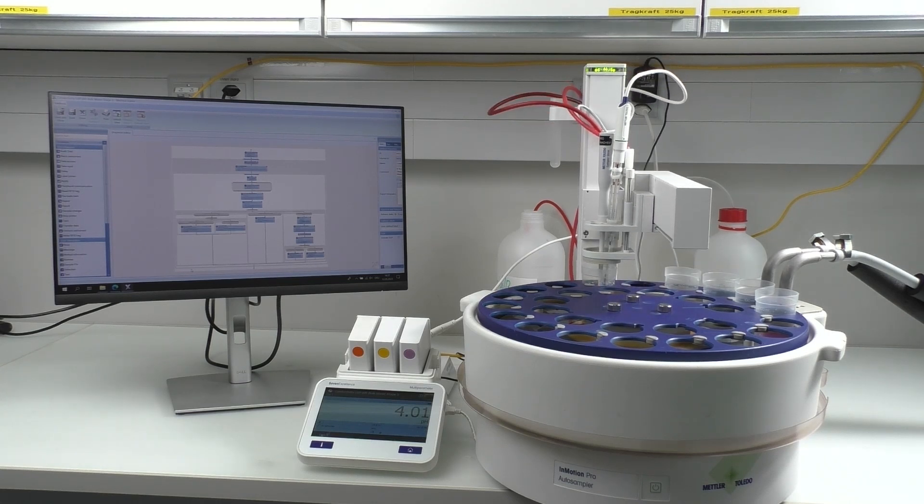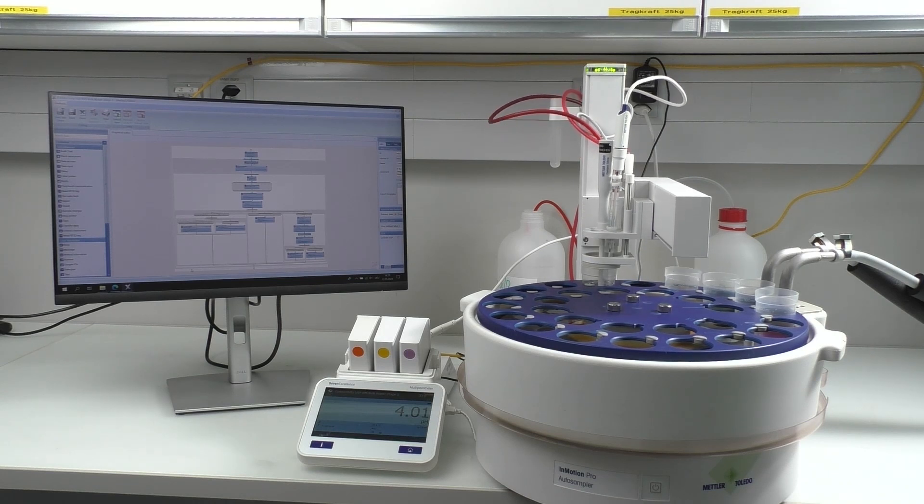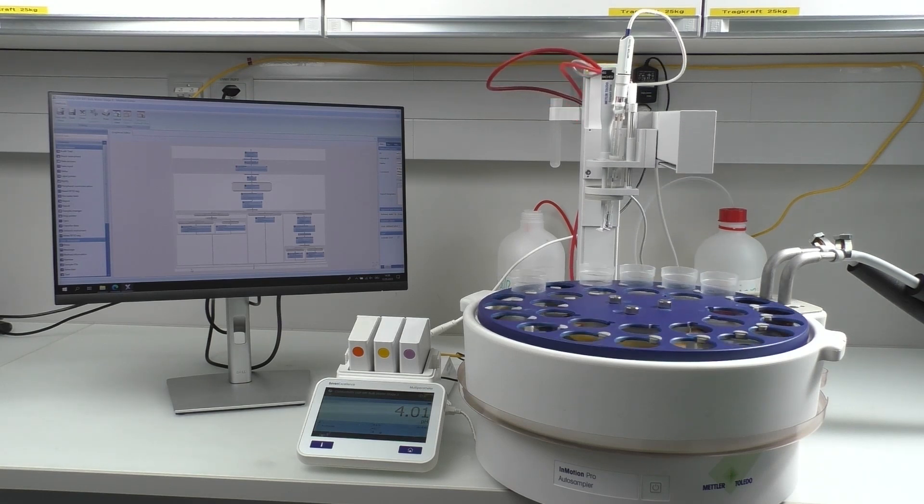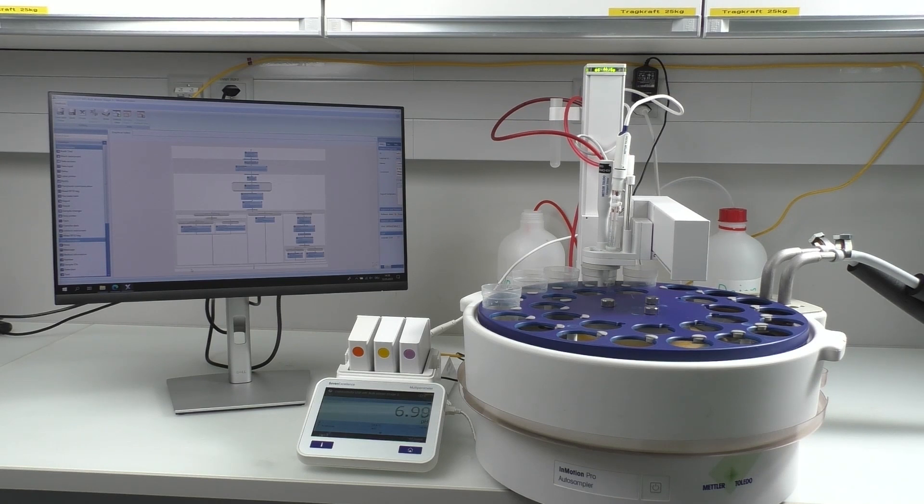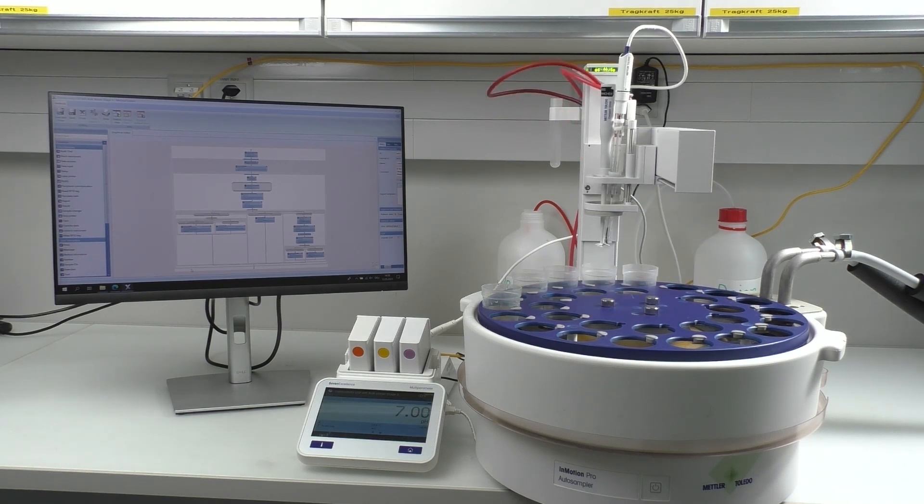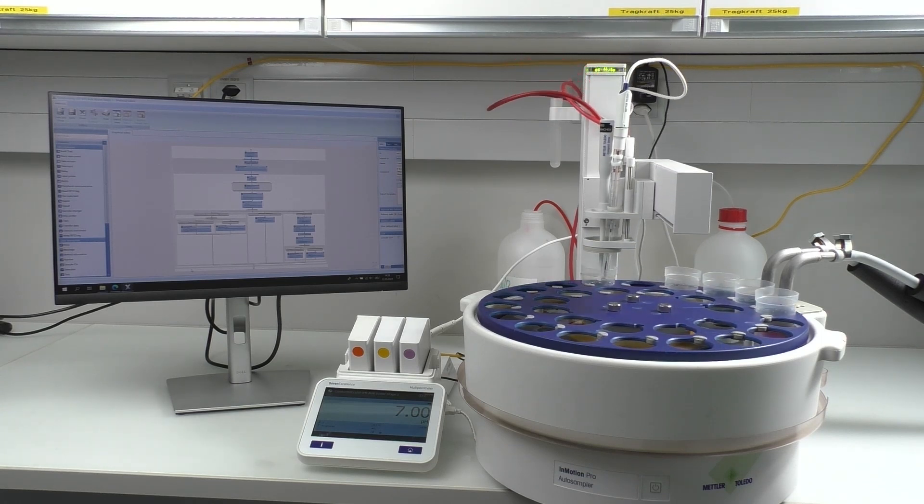If the slope is in the range of 90 to 110 percent, and the offset is plus or minus 20 millivolts, it means that the electrode meets the requirements of USP645. If not, the system will stop the process, and the electrode should be switched to a new one. This is automatically controlled to avoid random errors.